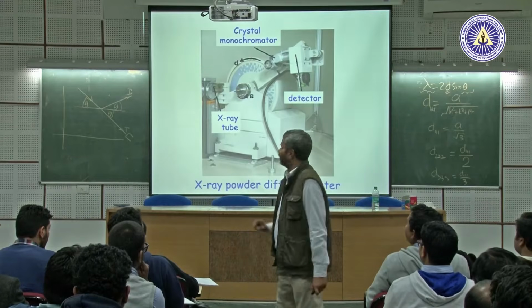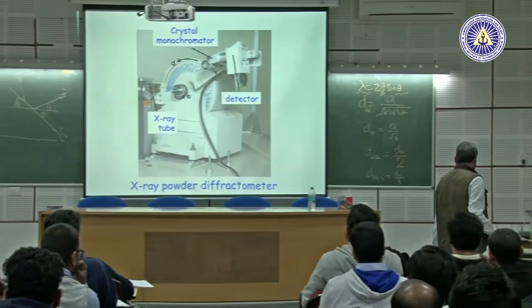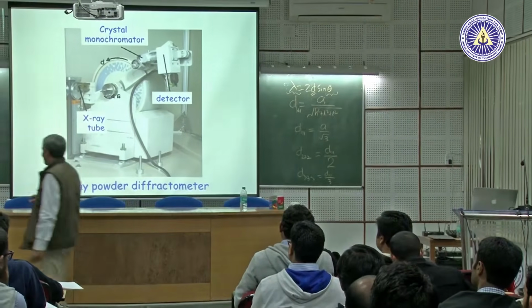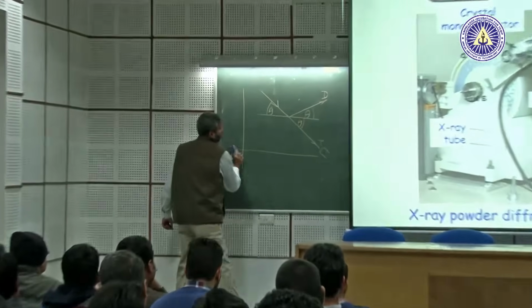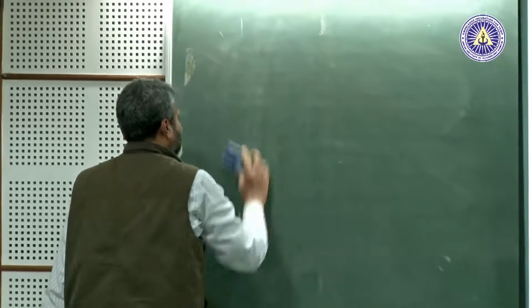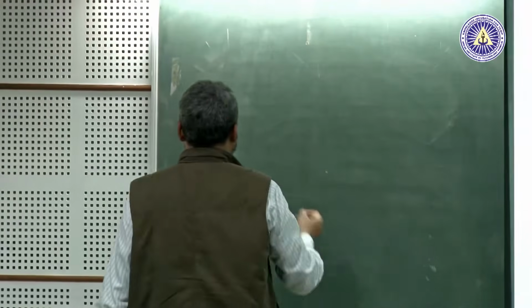No, the transmitted is fixed by the geometry. In fact, you will never try to actually take your detector to the transmission line, because the transmitted beam is very strong and your detector will burn. So, the X-ray diffractometer suppliers set the goniometer.